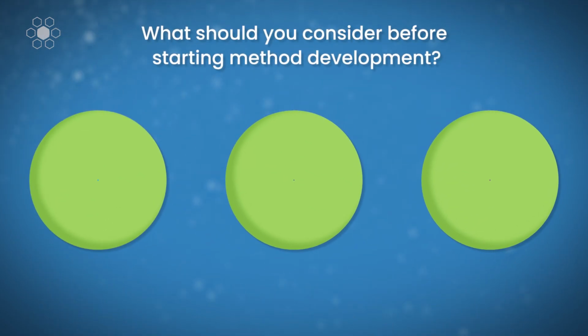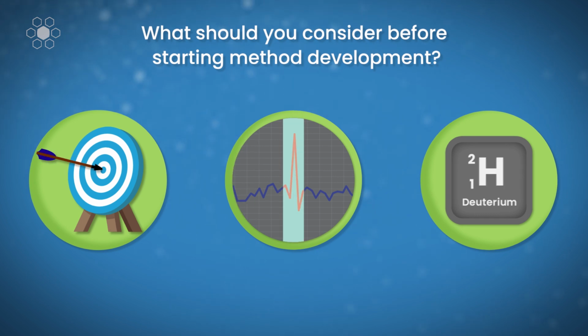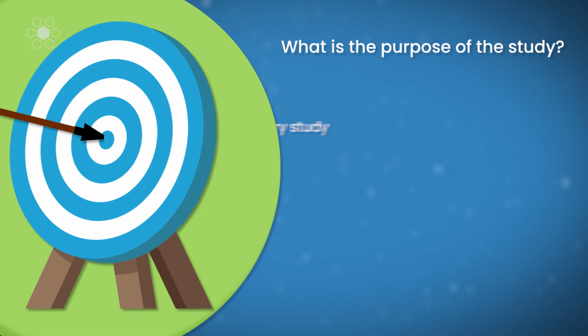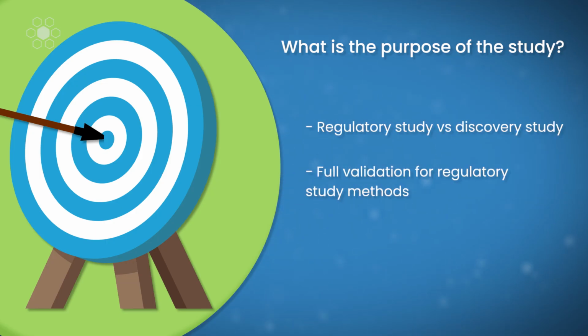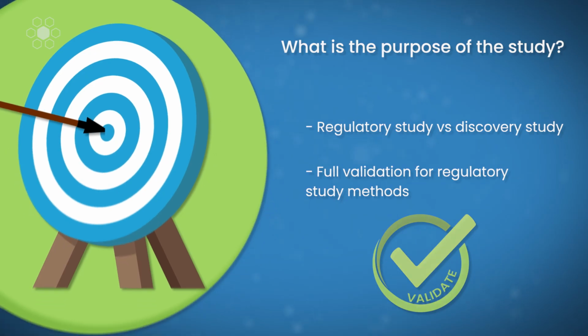Before starting method development, multiple essential questions need evaluation. What is the purpose of the study? Regulatory study methods will require full validation, so this should be accounted for in method development.